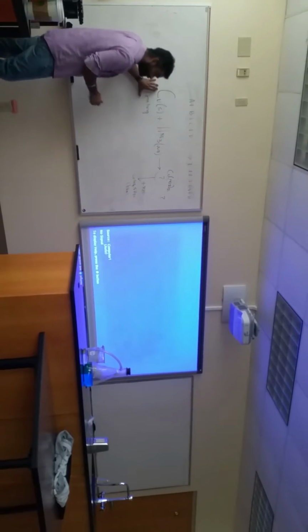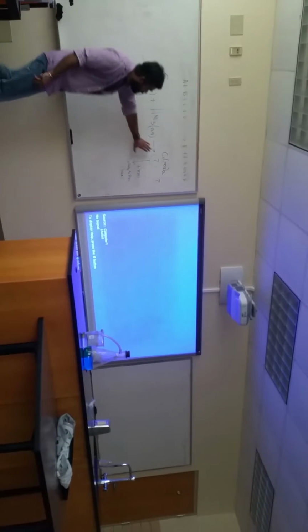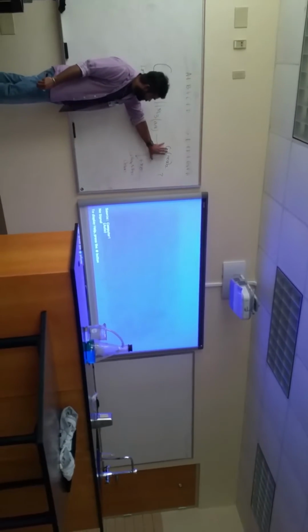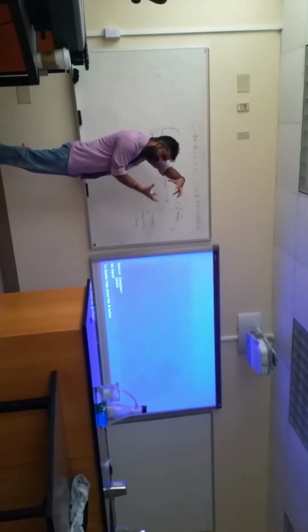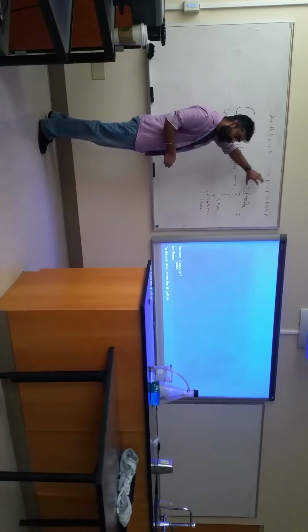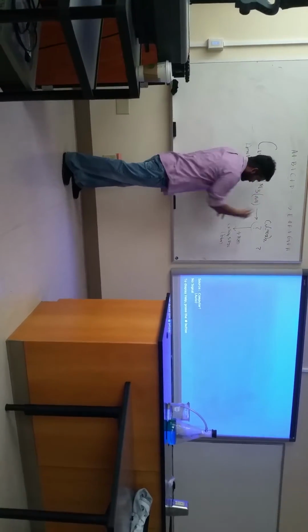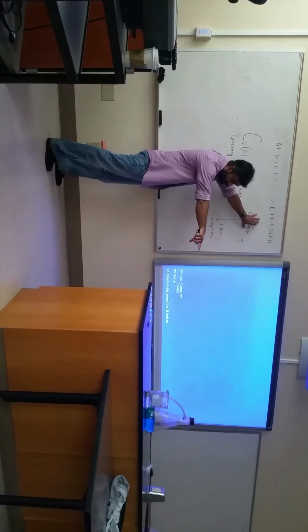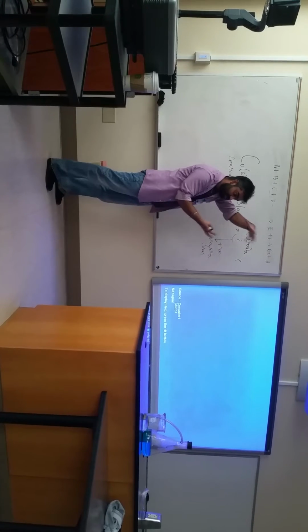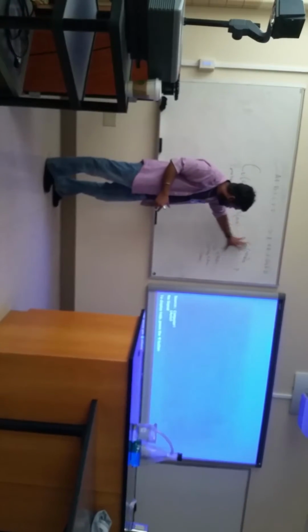So in this case, the copper, solid copper metal was limiting, and then it made copper nitrate. Now copper nitrate was at the bottom of the flask, and then you had all that hot gas on the top. When the hot gas cools down, the water is sucked back in, and it made this. This is limiting now because there's only so much of it was on the bottom of the flask. The rest of it was all nitric acid and the orange gas, the reddish gas that you can't see.